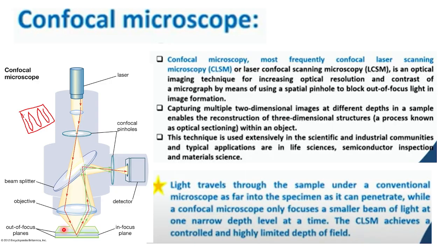This is your sample. So what does it mean when it is the depth of sample? That means when it is pinpointed, you can get, just by changing the angle of the splitter, radiation can penetrate a little bit inside your sample. In that way, it is getting the data from the depth. Or otherwise, you can do it very cleverly.